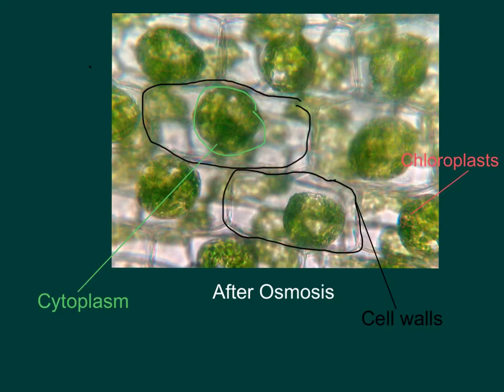Hello. In this slide, I will be explaining plasmolysis. However, before that, I will show you where the different organelles are. Here, we can see the cell walls of the cells of the Elodia plant, and here we can see the cytoplasm. The chloroplasts are here.